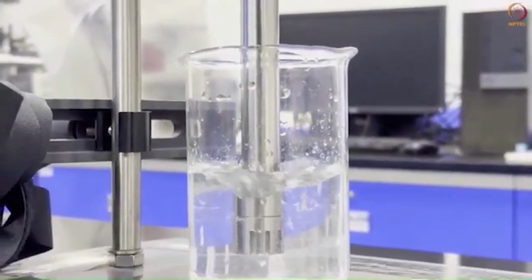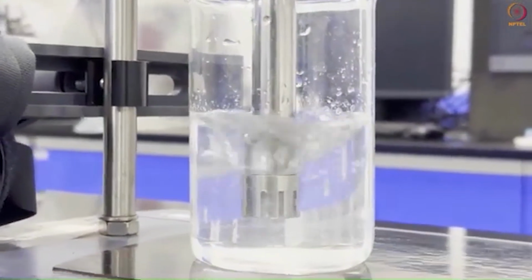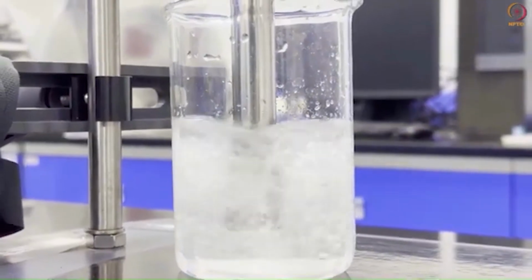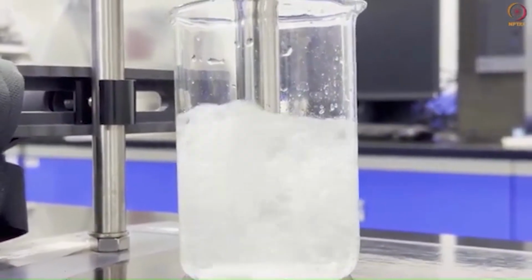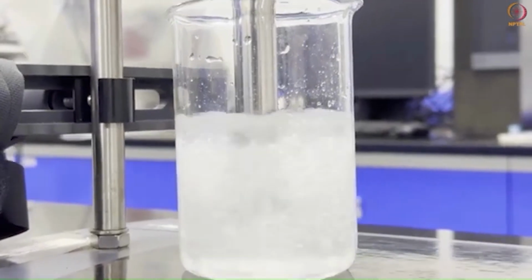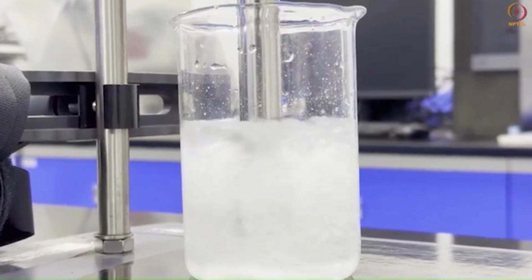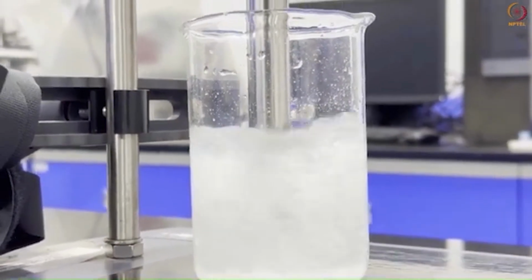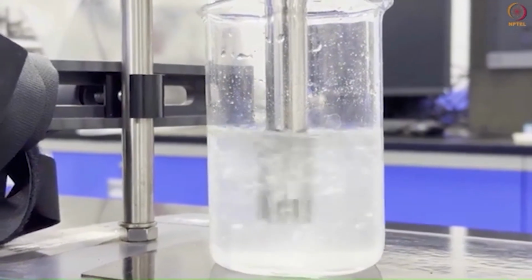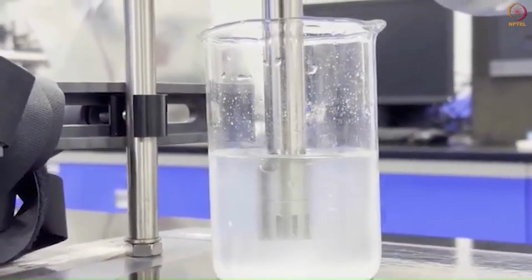Now we are at 6,000 RPM. This is at 10,000 RPM. So we see that we can go as high as 25,000 RPM and as low as 3,000 RPM.